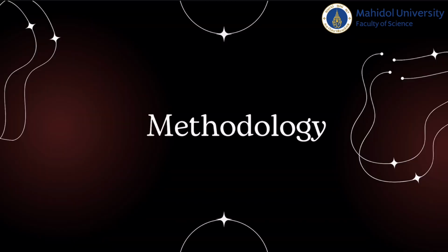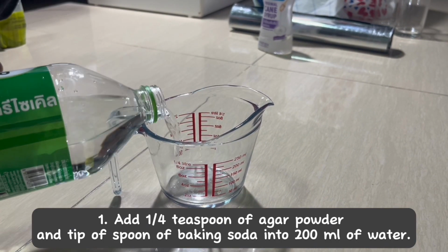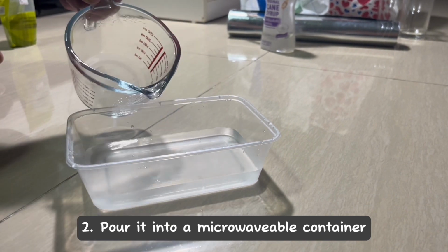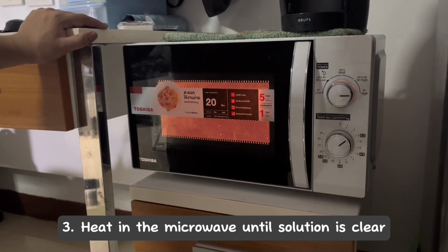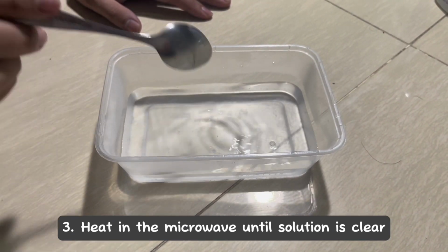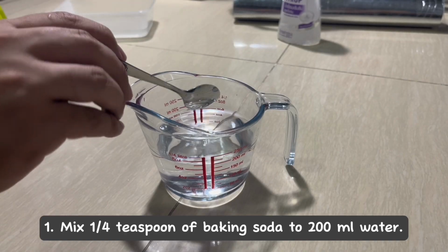And this is our methodology for the activity part. We will prepare the gel first, followed by preparation of the buffer.